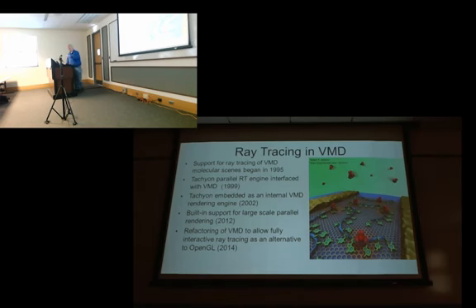All right, well, then we'll continue. So one of the unique areas in VMD going back some years is that VMD supports a rendering technique known as ray tracing. So just so you know the technological names of things, the typical rendering that you see in a tool like VMD, Chimera or PyMOL is known as rasterization, and that's using a computer graphics programming API known as OpenGL. Rasterization is able to draw things very rapidly. This is what video games use.